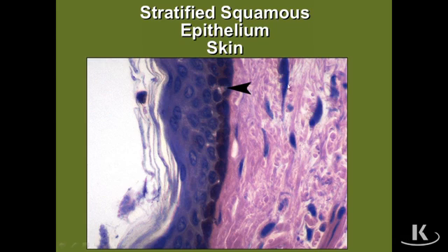And probably what's illustrated at the arrowhead is a lighter staining melanocyte because they lie directly within the basal layer of this epithelium. Note that this epithelium has a prominent basal layer, and it is the cells in the basal stratum that make up the stem cells that regenerate all of the other cell types in this epithelium, particularly with regard to the keratinocytes.